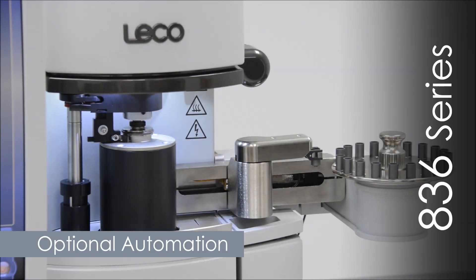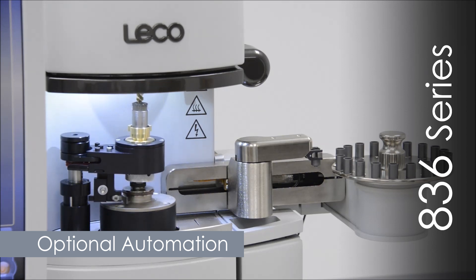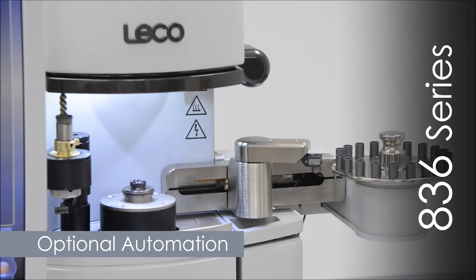Optional automation packages can further simplify your analysis with options such as an auto cleaner and 20-sample shuttle loader.